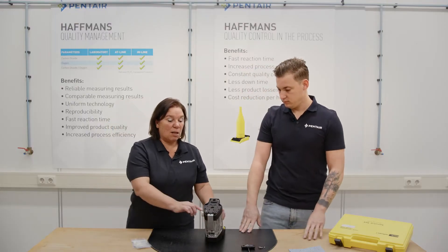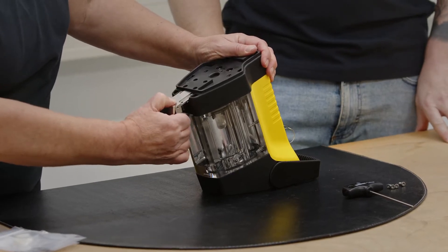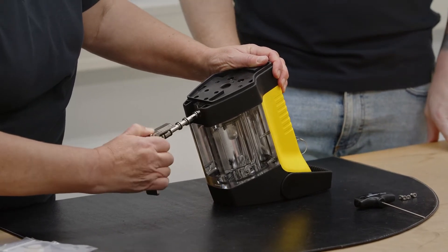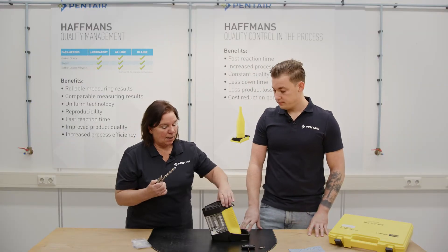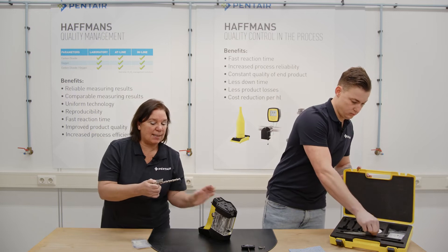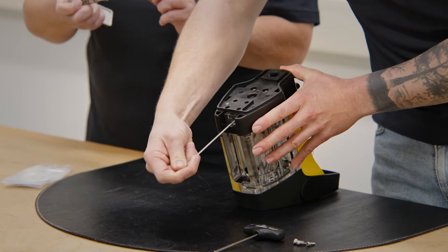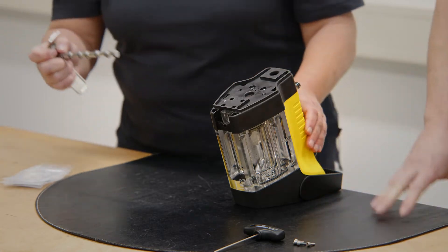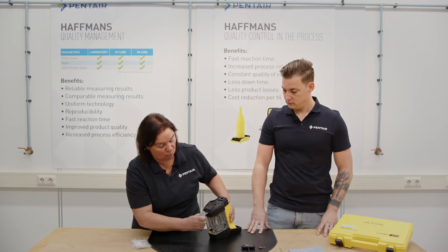Unscrew the four screws. We can try to take out the plunger — turn a little to move the plunger out carefully without damaging the plunger block. We can then quickly clean the plunger, also the plunger hole with the brush in the service set. Replace the o-rings when needed, or just clean and grease them again, and place the plunger back by turning it without damaging the plunger block.